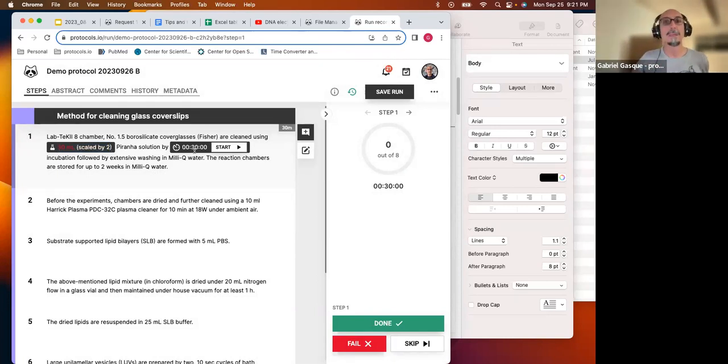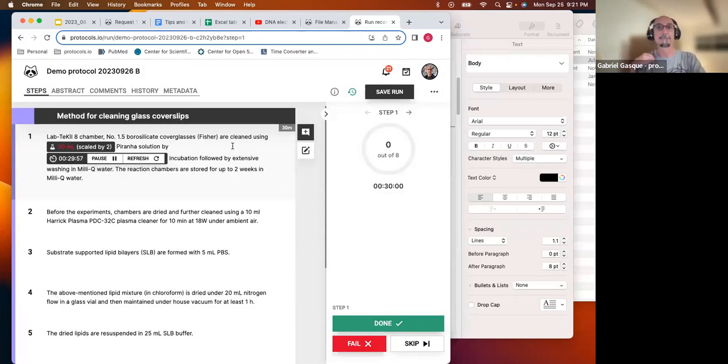By using the duration component, I'm actually creating real timers that I can play instead of using my own timer. And when the time is over, the computer will let me know with a beep. So these are some of the advantages of using these components.